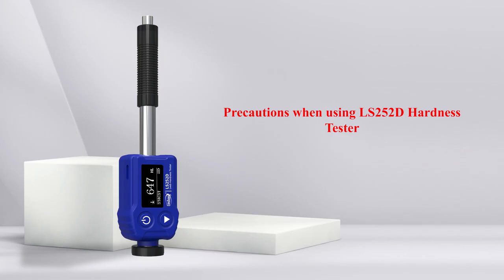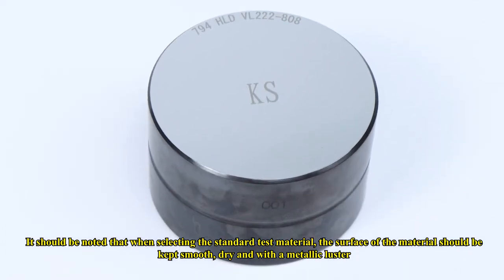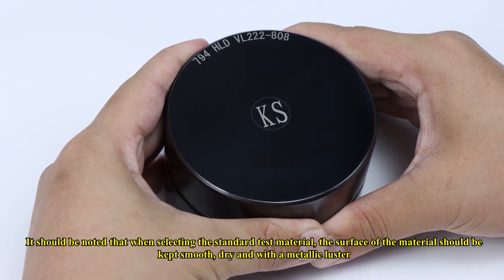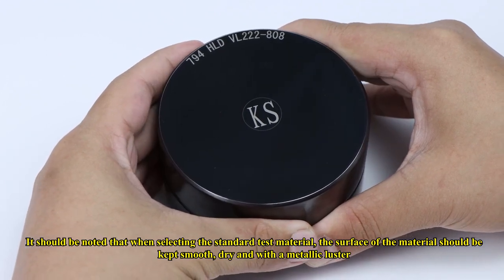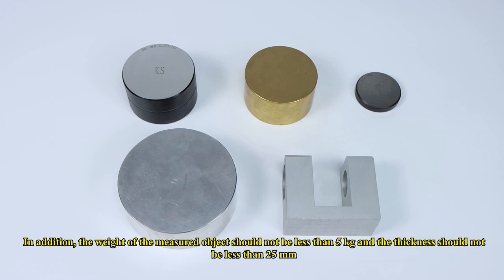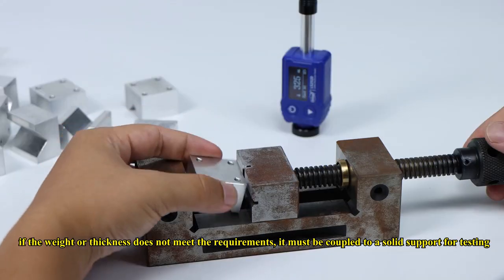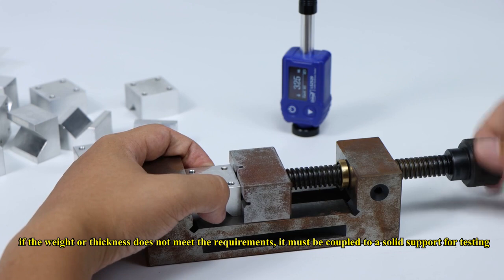Precautions when using the LS252D Hardness Tester: when selecting the standard test material, the surface should be kept smooth, dry, and with a metallic luster. Additionally, the weight of the measured object should not be less than 5 kg and the thickness should not be less than 25 mm. If the weight or thickness does not meet these requirements, it must be coupled to a solid support for testing.